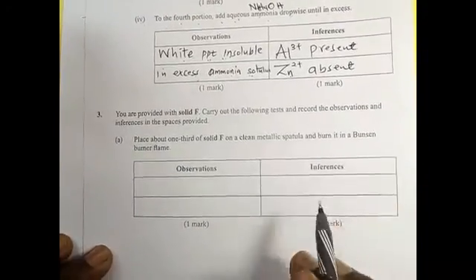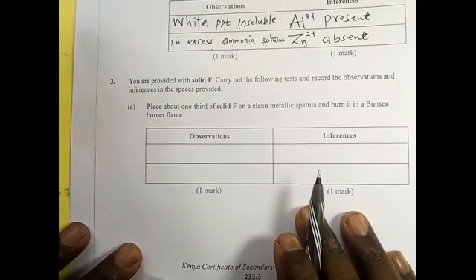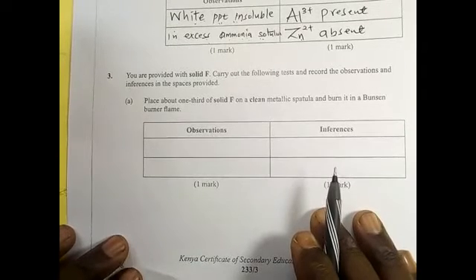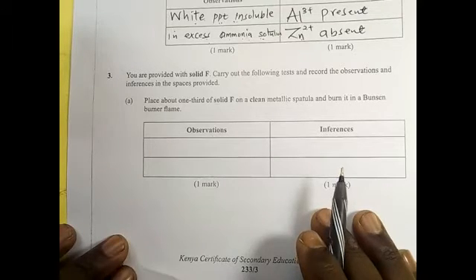Let us go to number 3. You are provided with solid F. Carry out the following tests and record the observations and inferences in the spaces provided. Place about 1/3 of the solid F on a clean metallic spatula and heat it in a Bunsen burner.